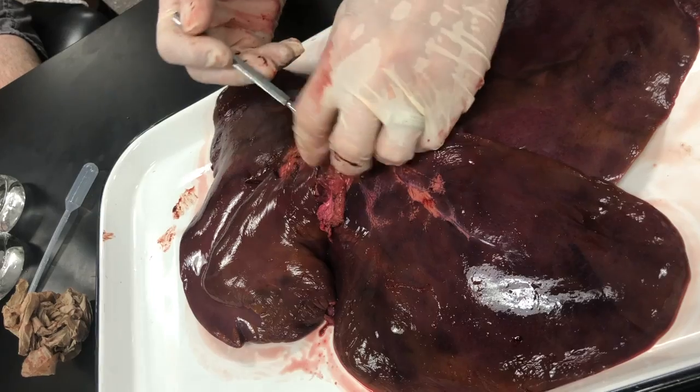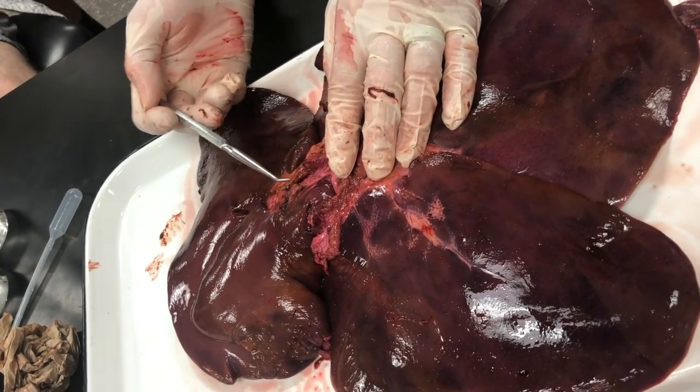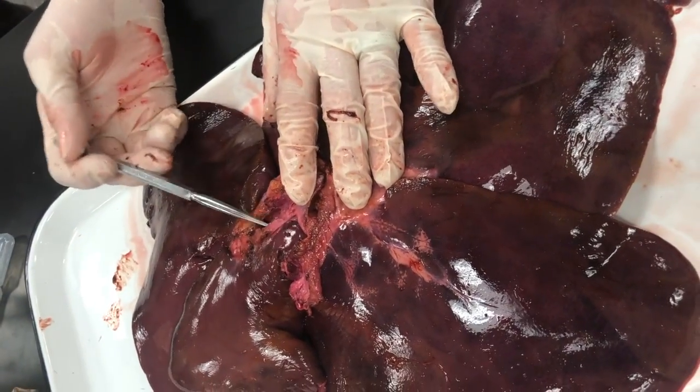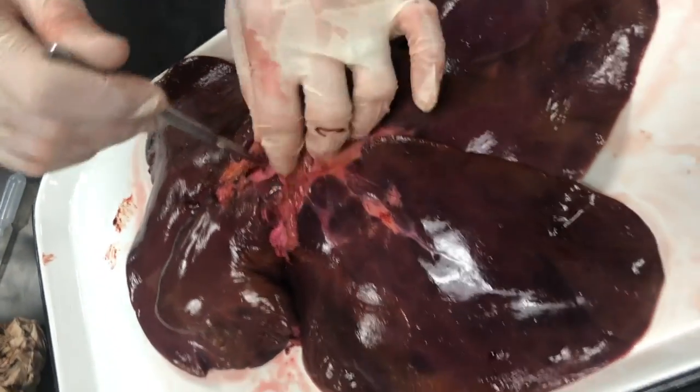Now, if you look at the walls of this vessel, what do you notice about them? Those of you who are close, yeah, they're really thin. So what would we guess this probably is? Vein. Yeah, so that's probably our hepatic portal vein. So it probably came in here.